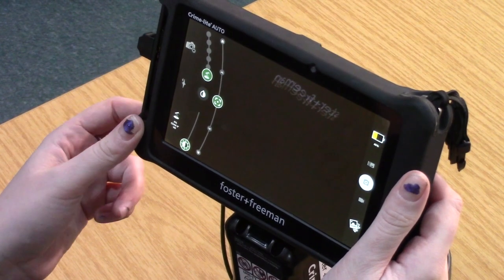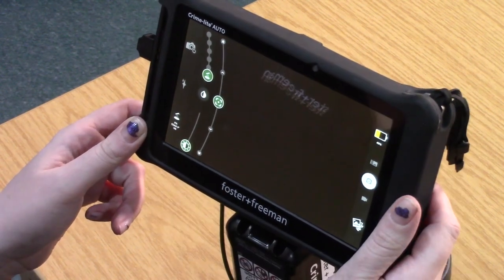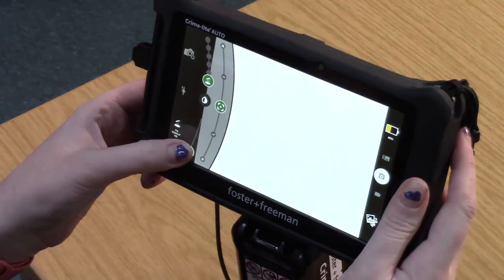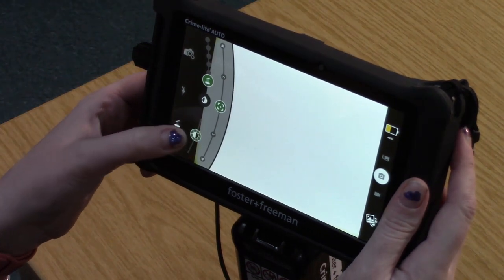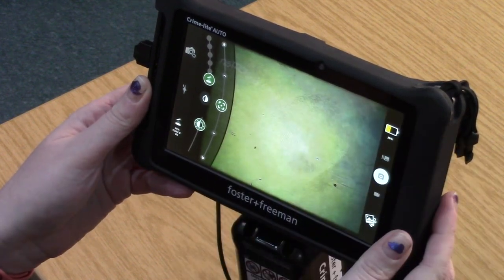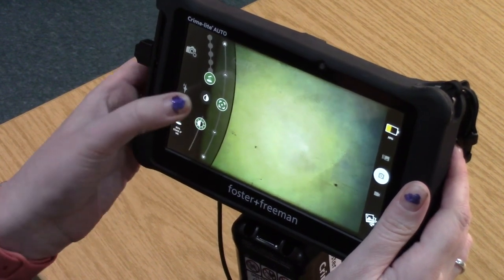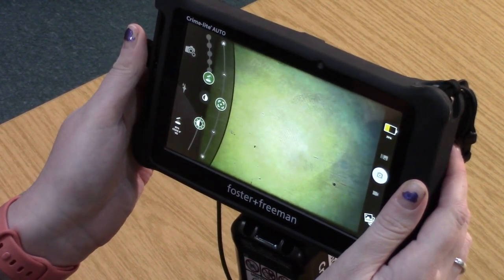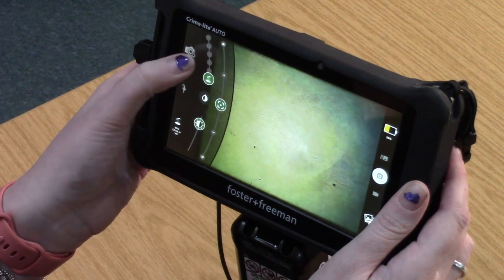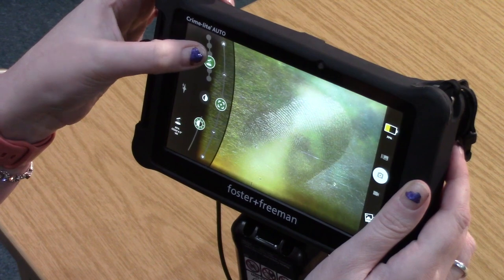Once we've attached our coaxial accessory via a micro USB cable, you can see on the screen our software has changed to a specific area for the coaxial illumination. We have brightness controls so we can change the light intensity, and we can already start to see an area where there is a finger mark. We have manual focus controls that allow us to focus on the area of the finger mark.